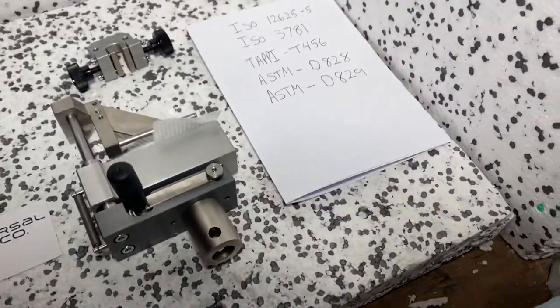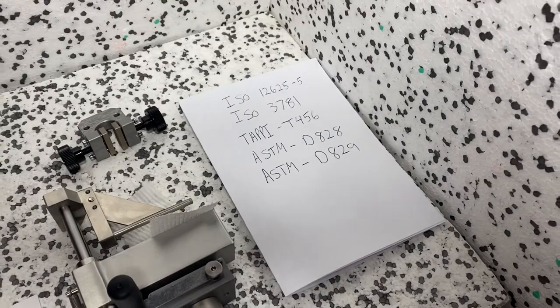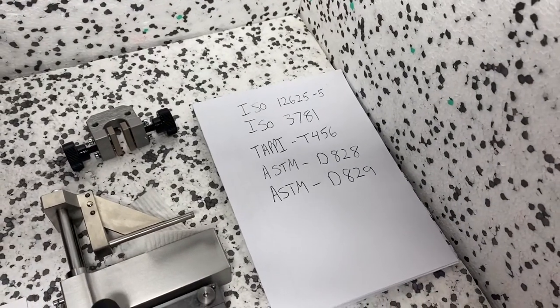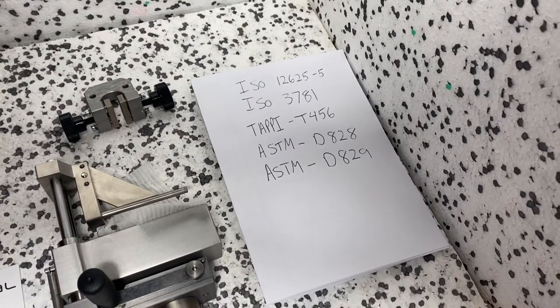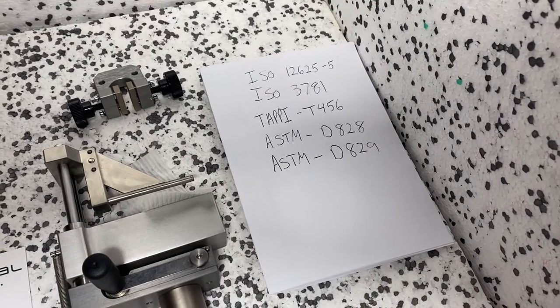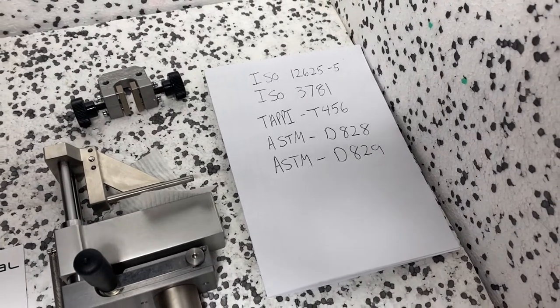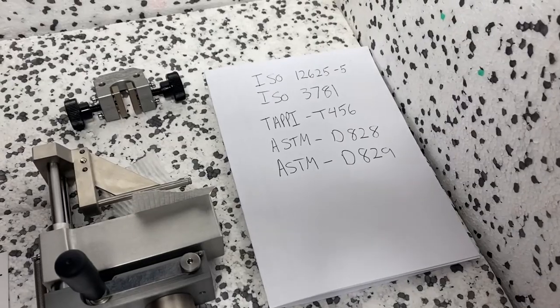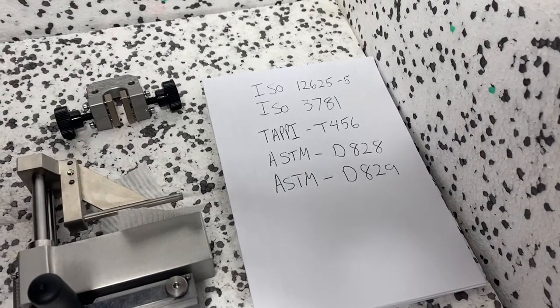This is the ASTM D828, can also use it for D829, the ISO 12625-5, ISO 3781, and the TAPI which is a paper and pulp standards testing protocol that's the T456.